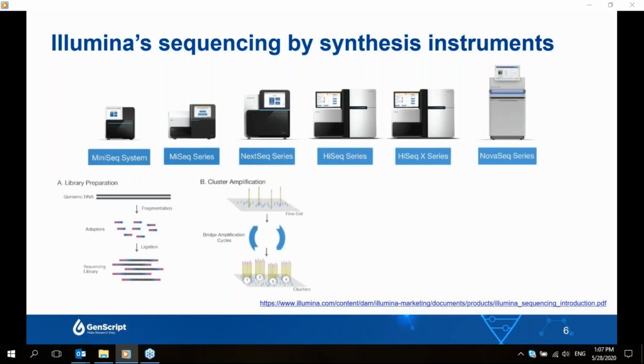Next, these molecules are loaded onto a carrier called flow cell, where bridge amplifications happen. It is a process that copies the DNA library information onto the flow cell through the sequences attached in the first step. A flow cell contains millions of positions, or officially called clusters, for library molecules to land and get copied, thus providing the massive parallelization.